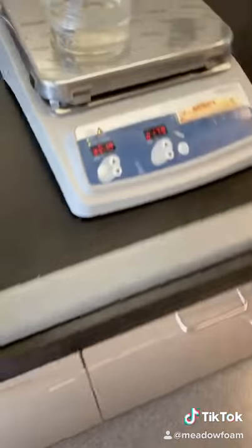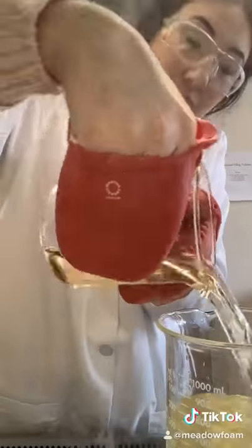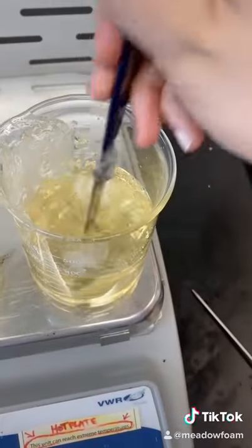I then put these oils on to heat, and here the gelling agents dissolve. Once both mixtures are at approximately the same temperature, I can pour them together to mix all the ingredients. Then off heat I add the last ingredient, an antioxidant called bisabolol.